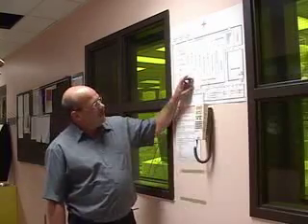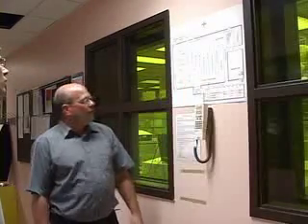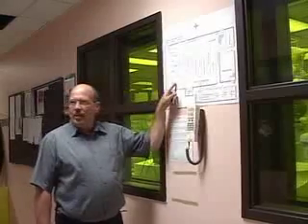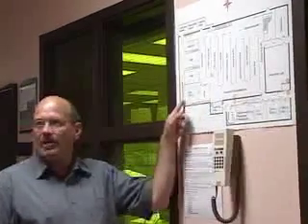The front of the clean room area that's called test and characterization is generally designed as a class 1000, with each of these bays being class 100. There is a class 10 area here in the submicron room, and the number of air exchanges and the HEPA filter coverage allows this design to be classified at class 10. So those are the different clean class levels that we have in the clean room: some class 10, class 100, and class 1000.